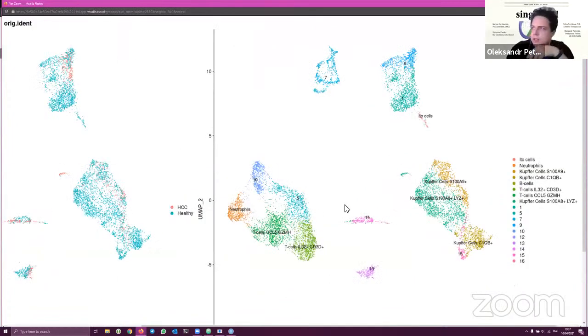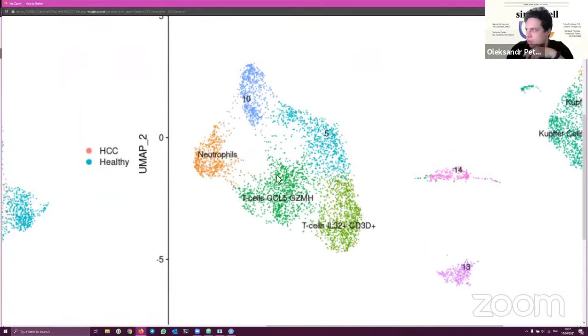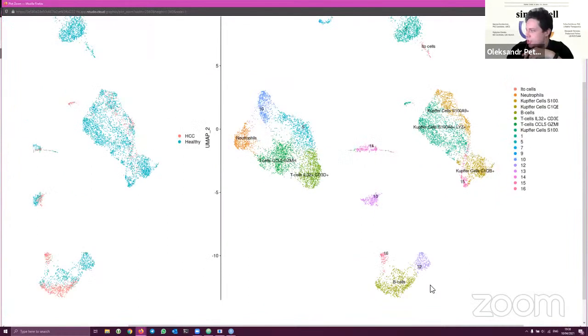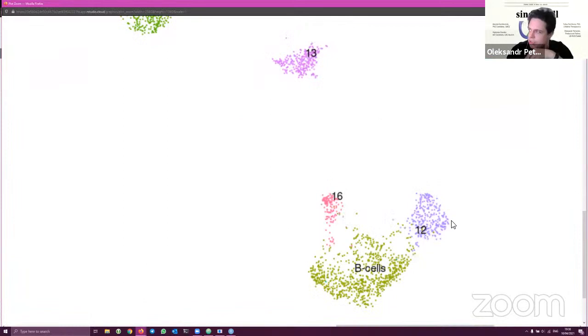And do you remember we evaluated the T cell marker, which apparently really indicates the T cells somewhere in these clusters. So we have T cells 1, T cells 2, neutrophils, questionable, but totally can be still here. And B cells here. So probably these 3 clusters are of different B cell origin. For example, some are plasmacytoid plasma cells, other cells are naive or memory B cells. These B cells also need to be identified in more detail.